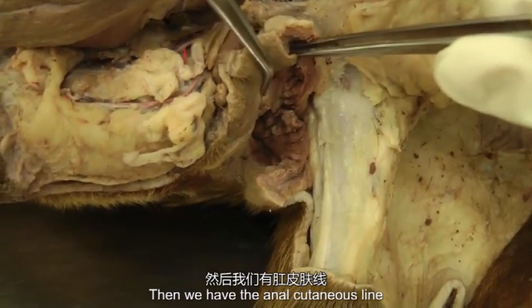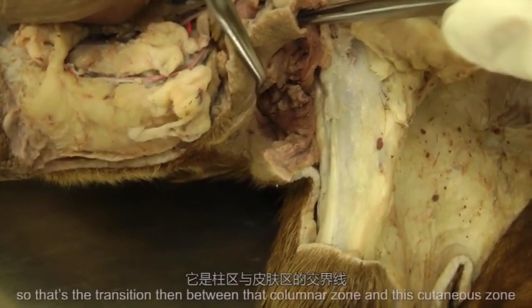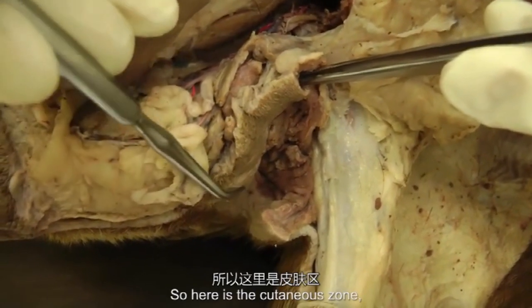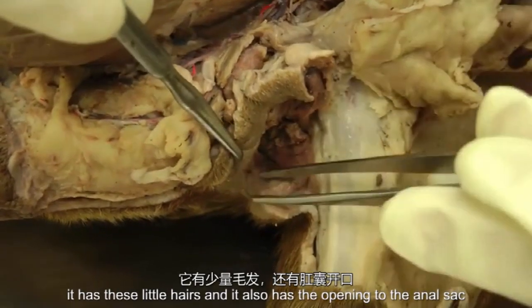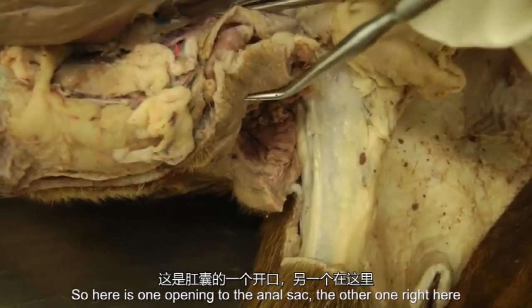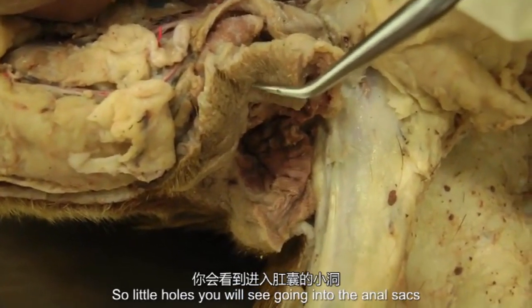Then we have the anocutaneous line, which would be right where the probe is here. That's the transition between the columnar zone and this cutaneous zone. So here's the cutaneous zone. It has these little hairs, and it also will have the openings to the anal sac. So here's one opening to the anal sac, and the other one right here. So little holes that you'll see that go into the anal sacs.